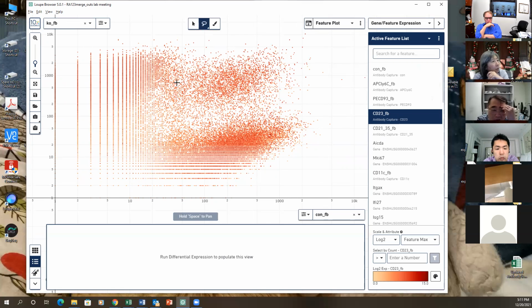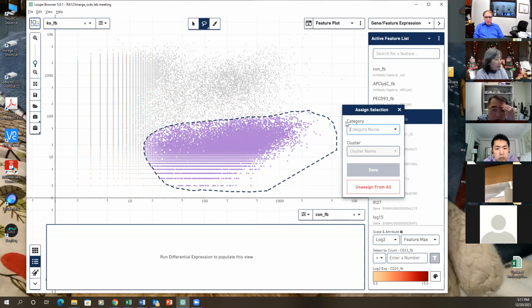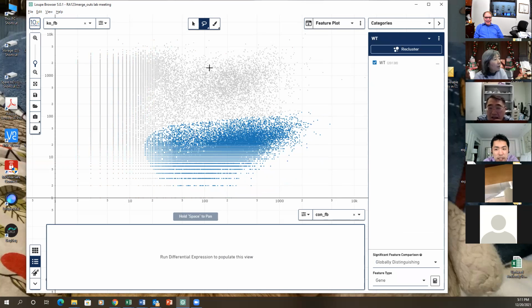Yeah, it doesn't do it. You're doing it too fast. No. There, you see, it does it. All right. Be patient. Why do you rush around? You need to give a name, right? We wouldn't rush around like this. Right? You're teaching everybody a bad thing. Okay. You got to rush around, not look at your data carefully. No, we do it the right way.